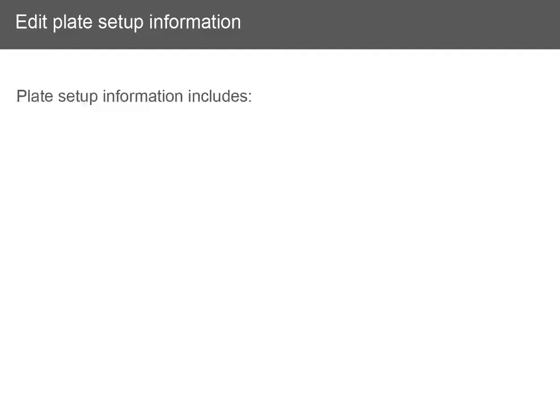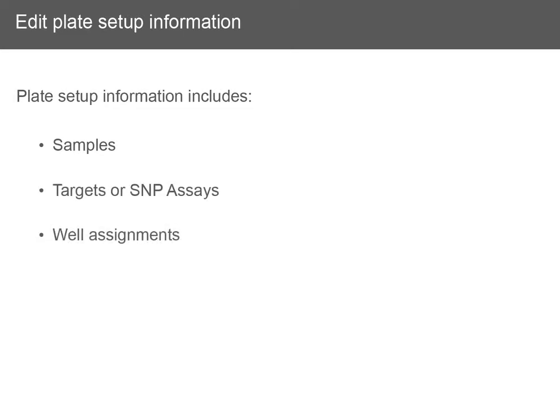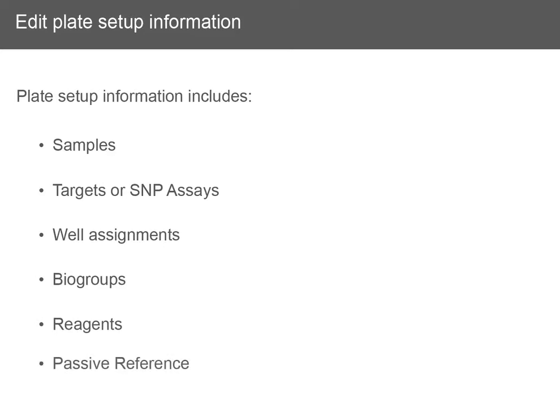Plate setup information includes samples, targets or SNP assays, well assignments, bio groups, reagents, and the passive reference.